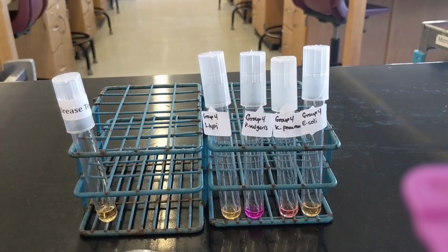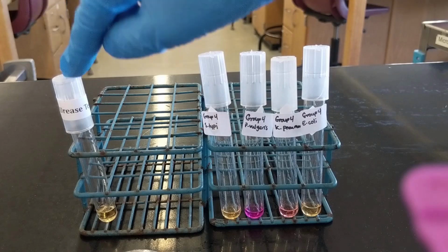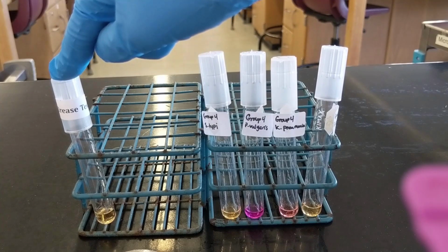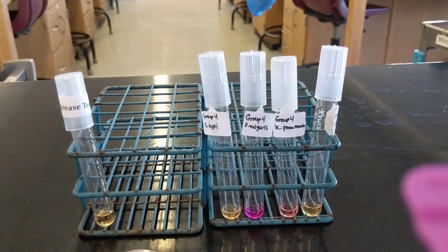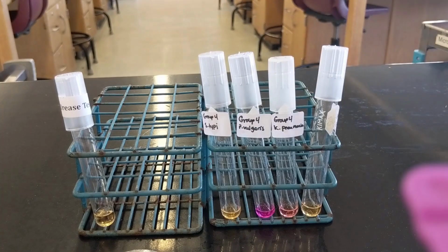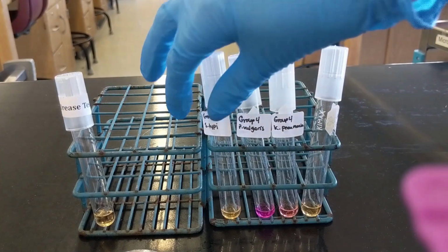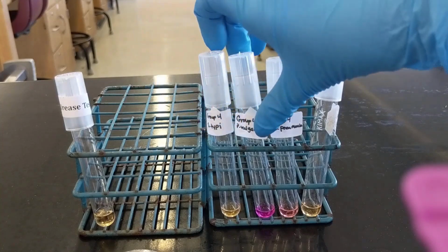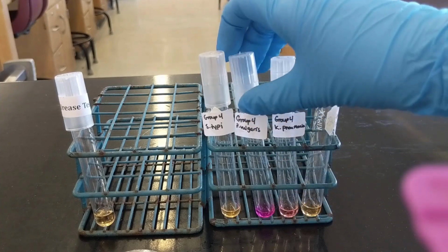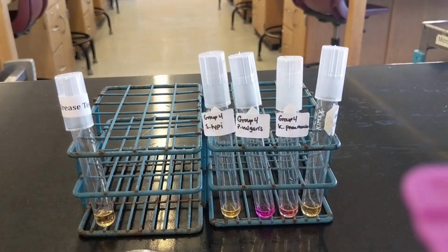The theory is that the substrate urea, which is contained in this broth, when it's split into its products, the presence of ammonia creates an alkaline environment that causes the phenol red to turn a deep pink color. So that's in your book as well. So the presence of urease will create this nice dark pink color, which we see in P. vulgaris.